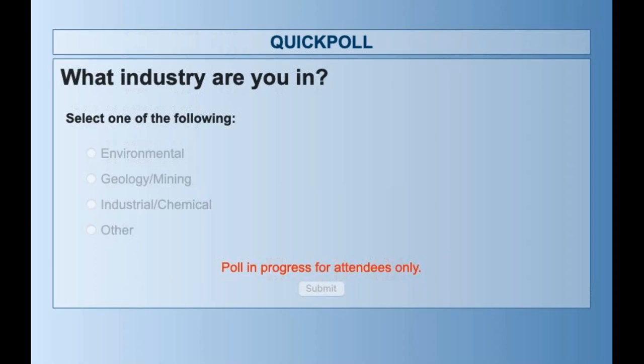Lithium is, first of all, the lightest of all the metals, and there are a lot of uses for lithium. We have lithium batteries, lithium in ceramics, lithium in glass, lithium in metallurgy, lithium in pharmaceuticals, lithium in polymers for air treatments and stuff like that. But lithium is also really important in the geologic environment, as it's the lightest element, and it's a group 1A alkali metal, so it has some strange behavior. So it really does a whole lot in trying to determine what's going on, whether it be fluids in the mantle or movement in the ecologic and the environmental aspect.